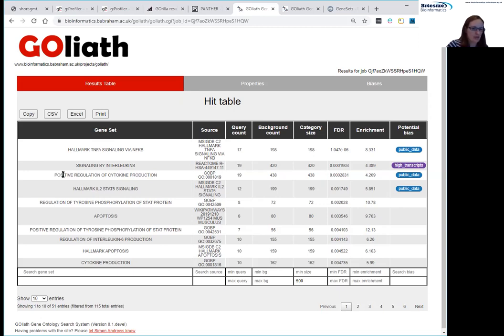And it can also be used as a complementary tool to others available, such as the ones that we've looked at briefly. So this is still very much under development, so any issues, then let us know, or feel free to make improvements on GitHub.